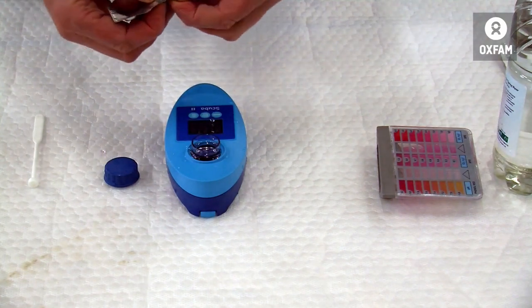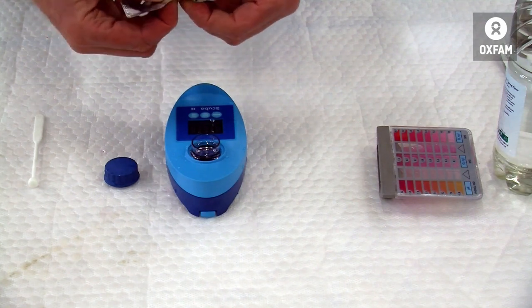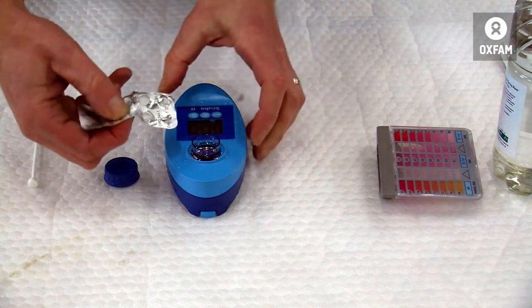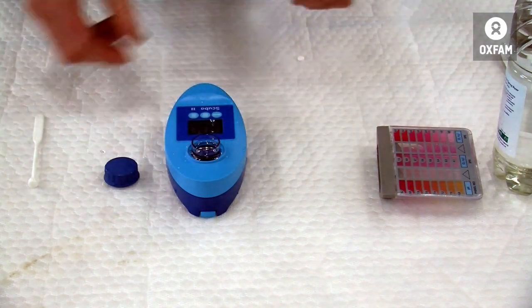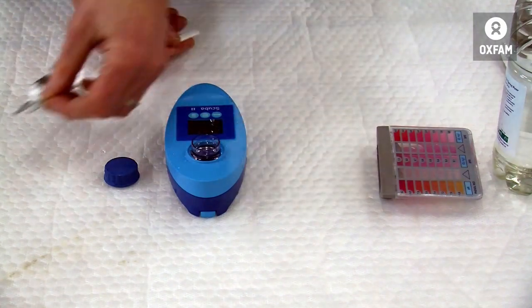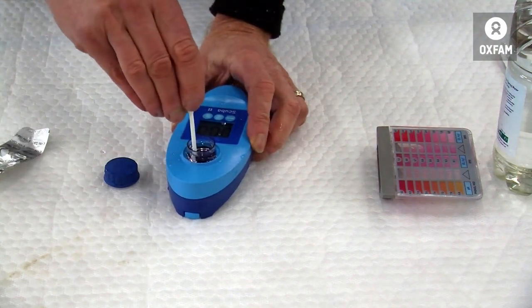Break the foil with your fingernail. Try and add the tablet without touching it with your fingers. Best not to drop it onto the work surface. Should we start again? Or should we use that one? And I'll crush it with a stirrer.